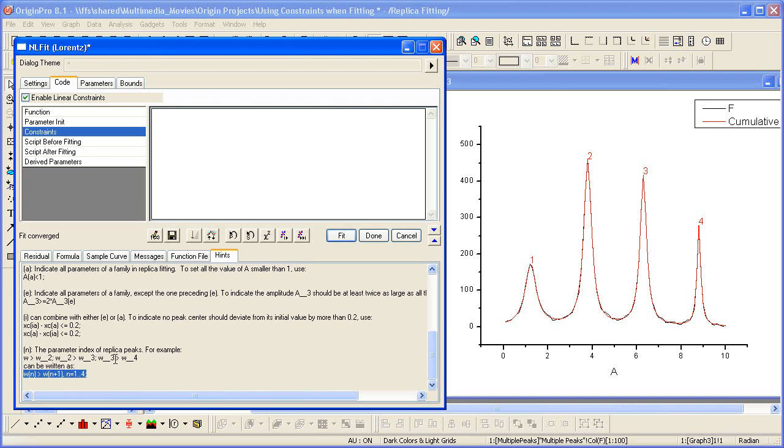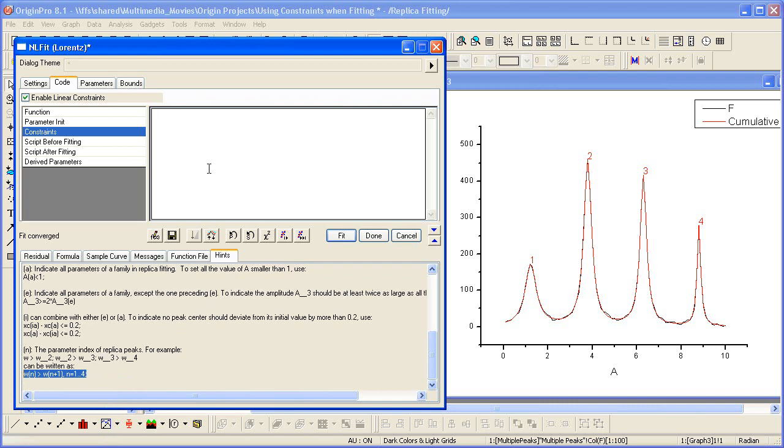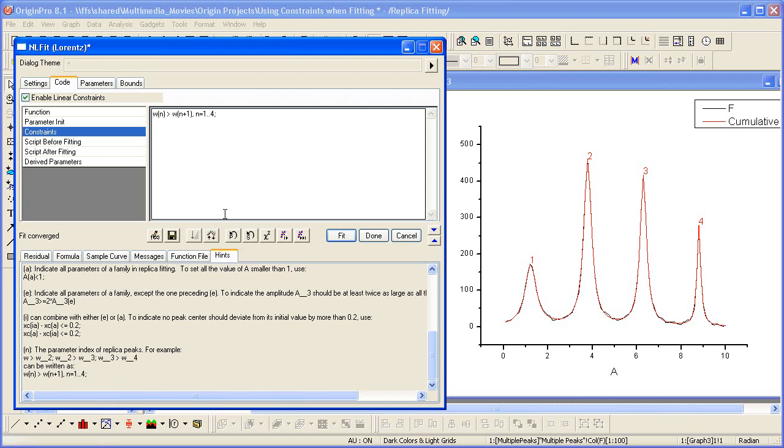Each successive peak width is going to be smaller. So I can copy this, paste it up here, and the only change I need to make is because we have the three replicas.